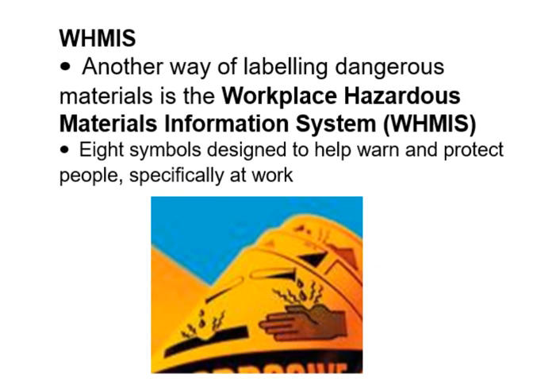Actually, I lied. This is an old slide. There used to be 8 symbols. This is now changed. I had to update my notes this year. There are now 9. They've actually updated WHMIS in the year 2015.